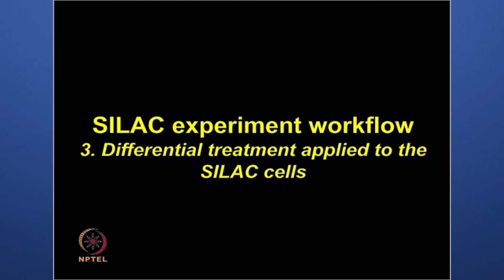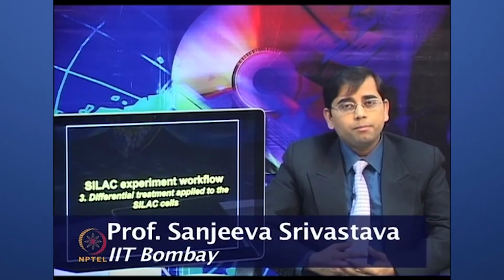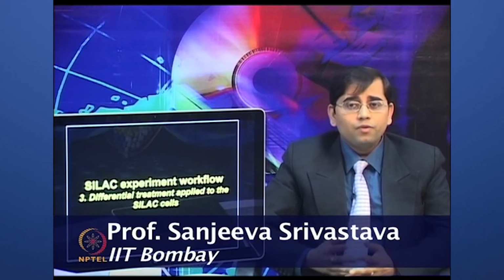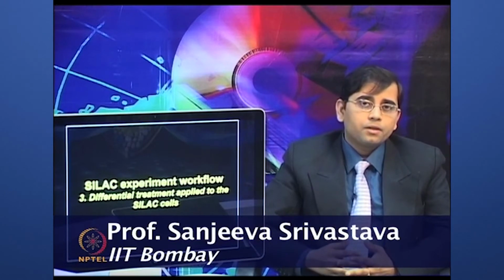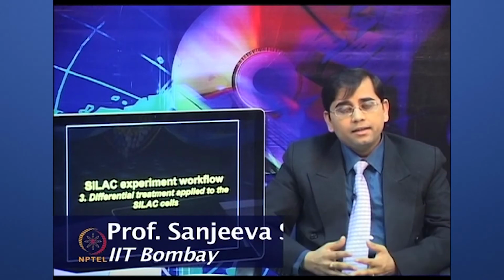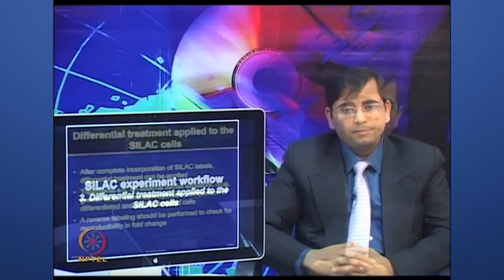Differential response between the control and experimental cell populations can be introduced by treatment of drug, growth factors to one cell population. Proteins from cells adapted to the light and heavy SILAC media can be analyzed and distinguished by mass spec.